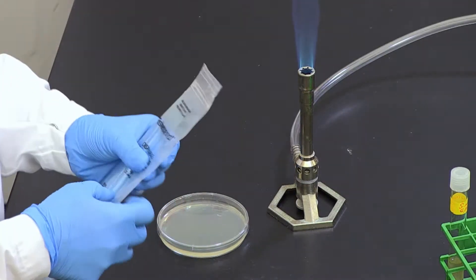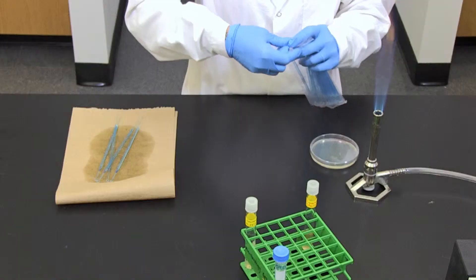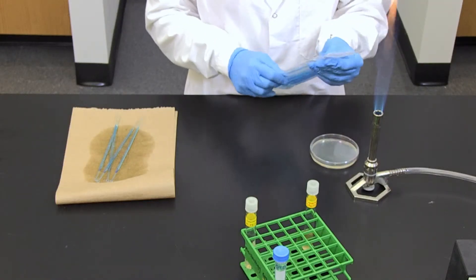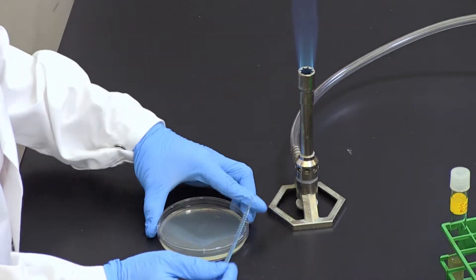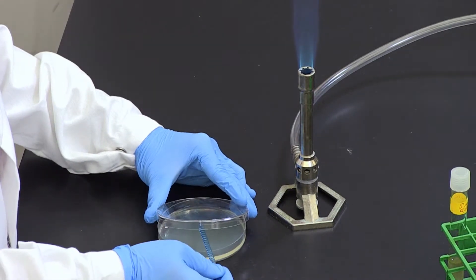Next, rotate the plate a final 90 degrees while keeping the plate closed, and streak area 4 several times back and forth with a sterile inoculating loop, hitting the third streak a few times.